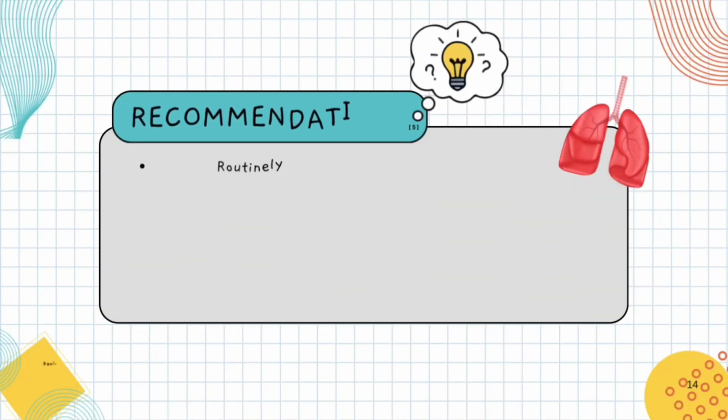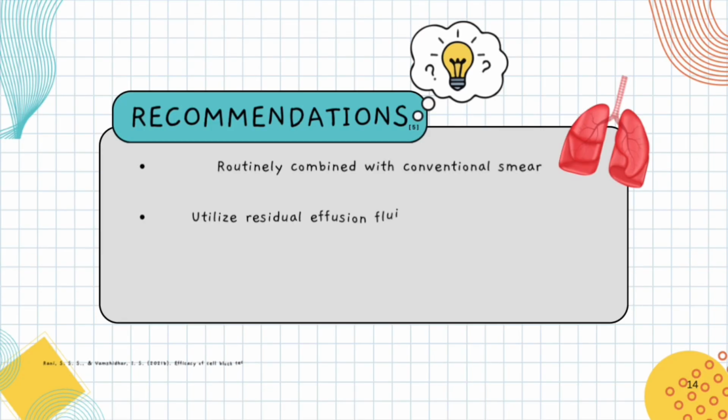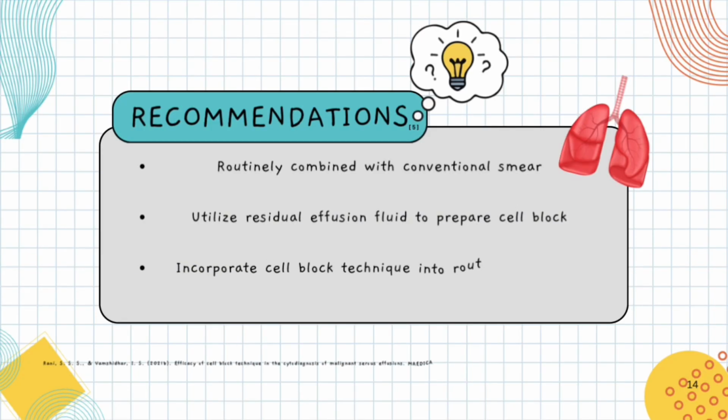Clinical recommendation. Based on this consideration, the cell block technique should be routinely combined with conventional smear to improve diagnostic accuracy. Residual effusion fluid should be utilized for cell block preparation to maximize diagnostic yield without additional sampling. Finally, cell block preparation should be incorporated into the routine diagnostic workflow of cytology laboratories, particularly in cases suspicious for malignancy, to support confident diagnosis.